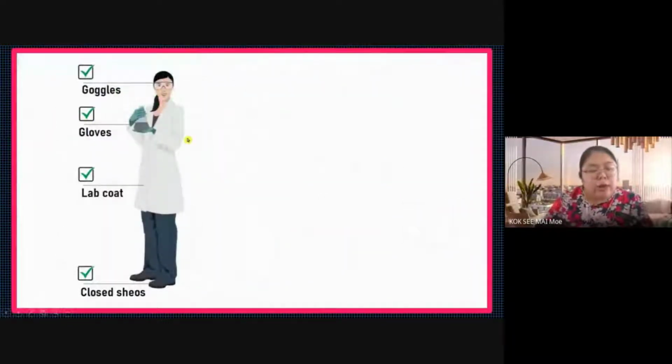Okay, so every equipment also has a function. You need to know the function. You know the name, you also need to know the function, because the question will ask what's the use, what's the function of this object. Okay, let's see the first one, goggles. Goggles, not googles. So the spelling must be correct.